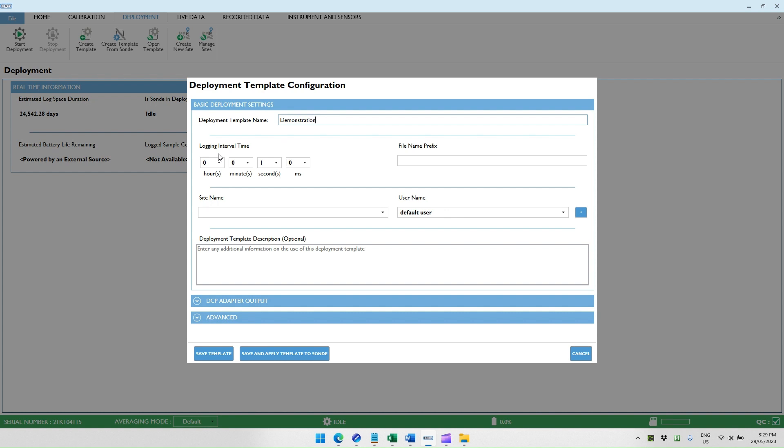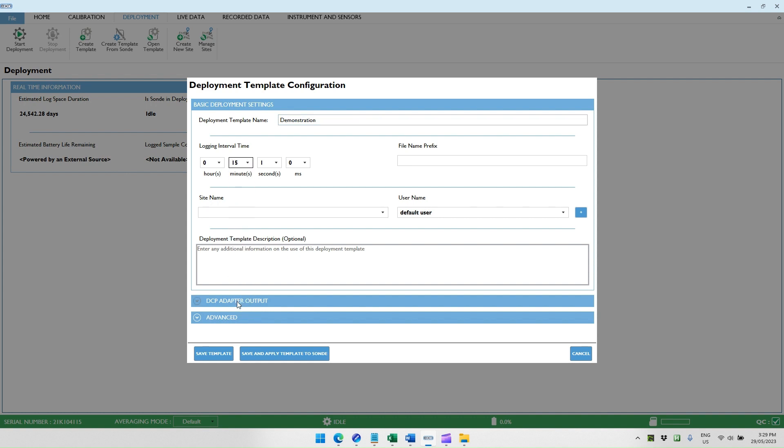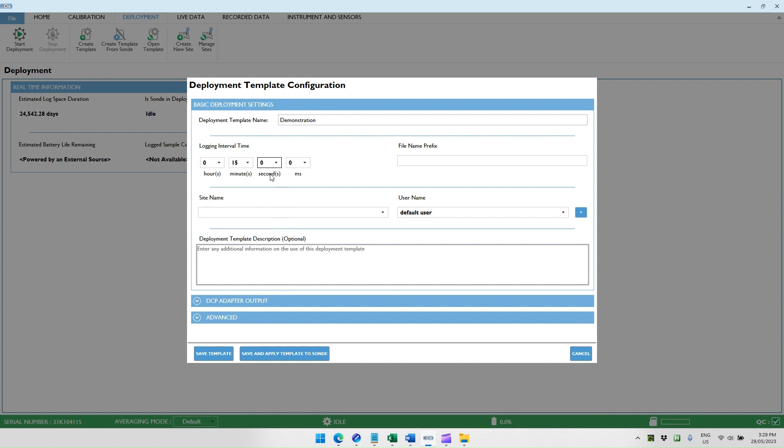Then you set your logging interval time. The AI-1 is programmed by default to log data from the sonde on a 15-minute interval, so for the sake of simplicity, we will be using the same interval. If you wish to change the interval, you need to change the program running on the AI-1 as well as the logging interval on the sonde. You can enter parameters such as your site name and username and give some detailed description if you want.